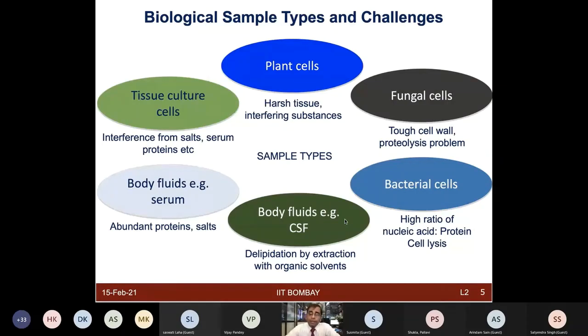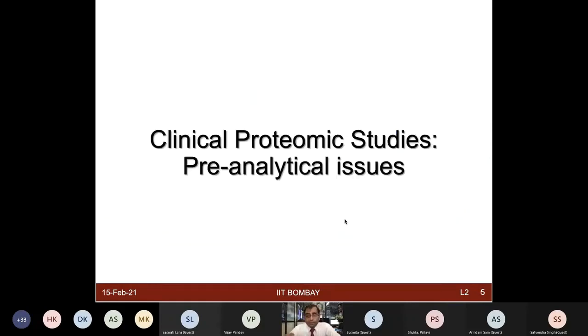This is where I think the user is the best person who knows about their biological questions and biological sample. You have to be intellectual enough to understand what interferences are going to come your way if you want to prepare a very clean and good protein sample, because everything else has to be removed from that sample except protein, to take it forward.